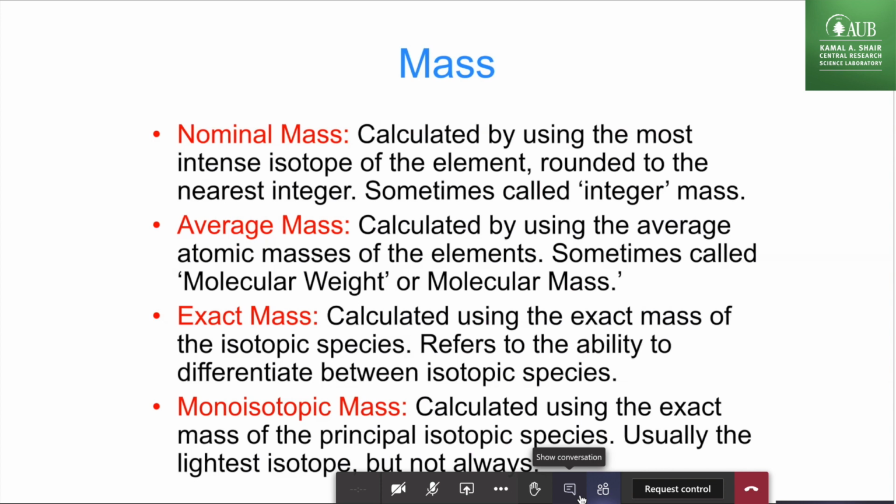You weigh the powder. And when you are weighing the powder on your balance in your lab, you are not separating the isotopes. So that's why it's important and why they write on the package the average mass or the molecular weight, because it's what you need to use in your calculations to make molarity or to make a solution.